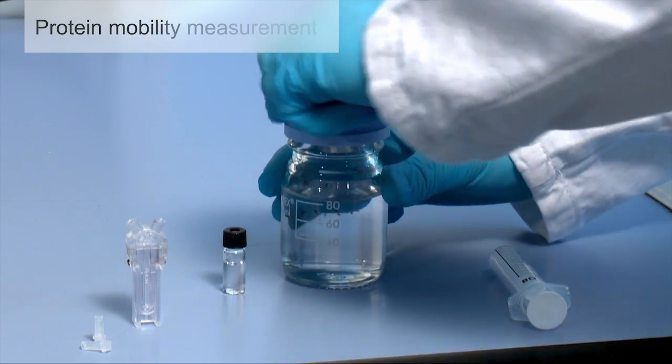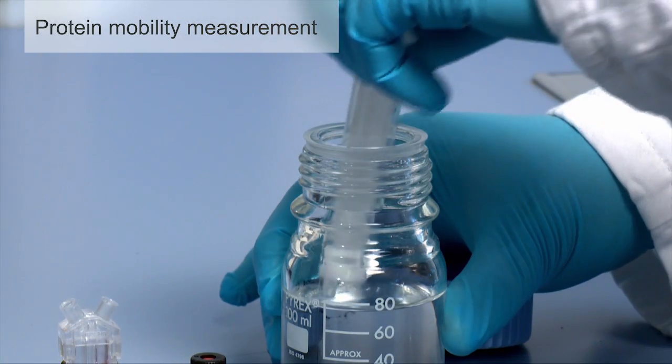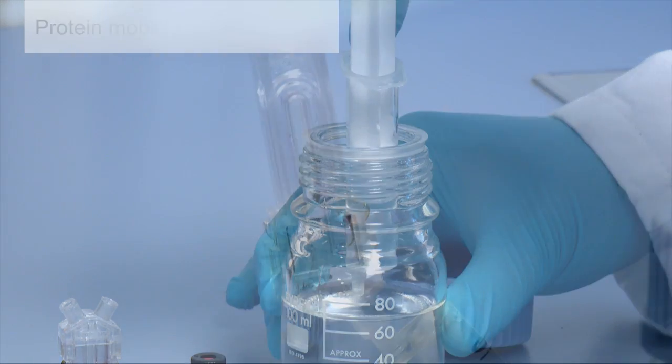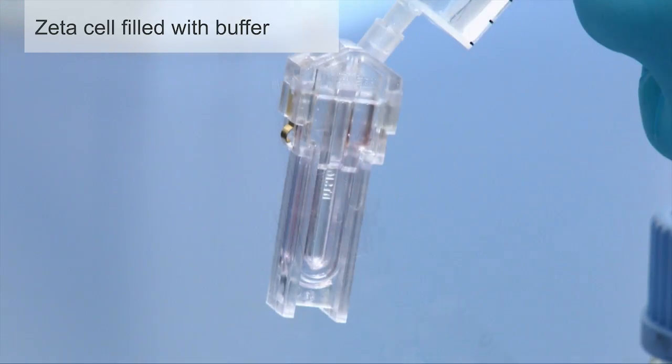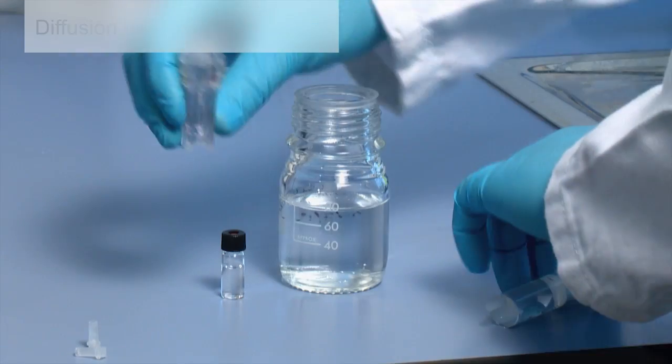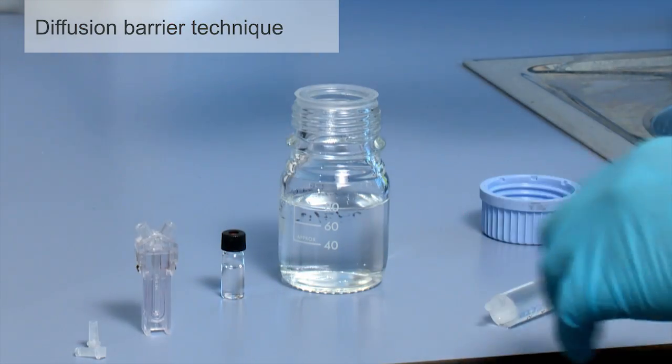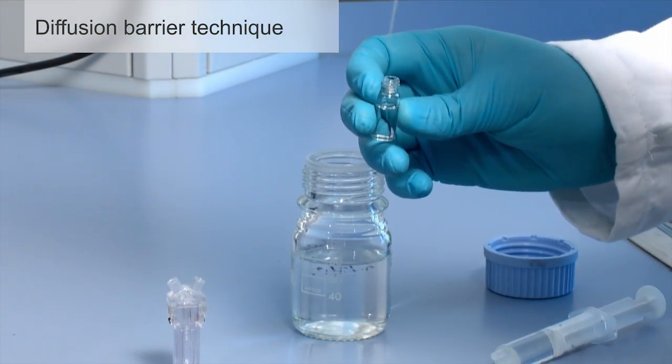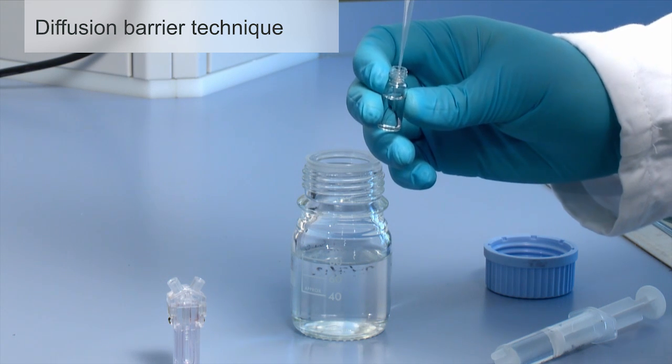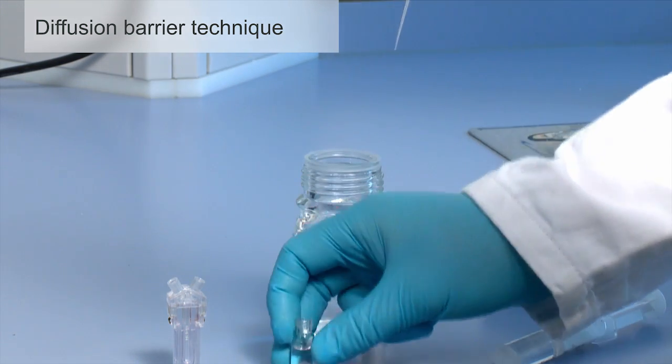Protein mobility measurements are best performed using the diffusion barrier technique which protects the sample from aggregation. First, the disposable folded capillary cell is filled with a liquid in which the sample is dispersed. The diffusion barrier technique separates the sample molecules from the electrodes so the effect on the protein caused by the measurement is dramatically reduced.